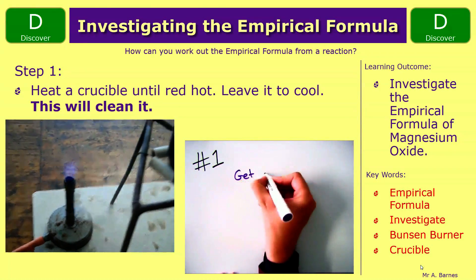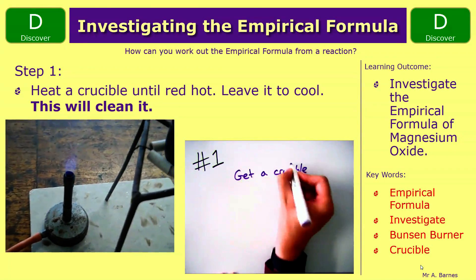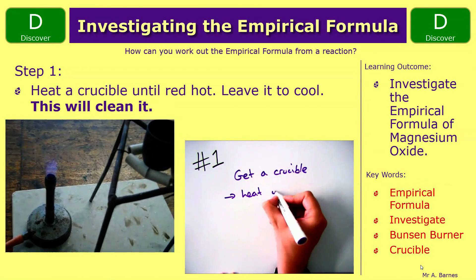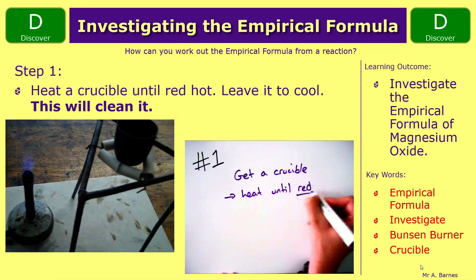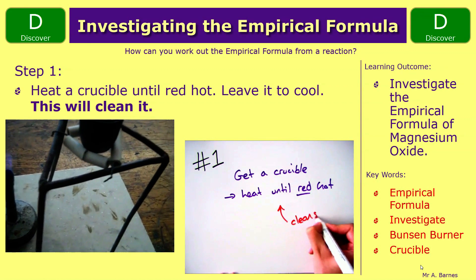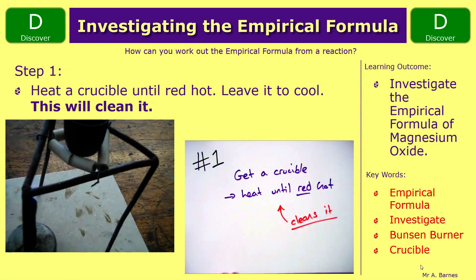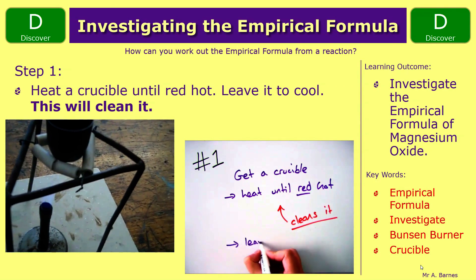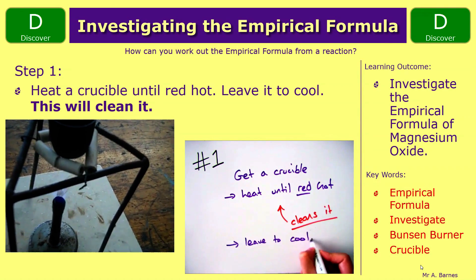Your first step is you need to heat a crucible until it's red hot and then leave it to one side to cool. By doing this you're cleaning it to make sure that there are no impurities when you start the actual experiment.